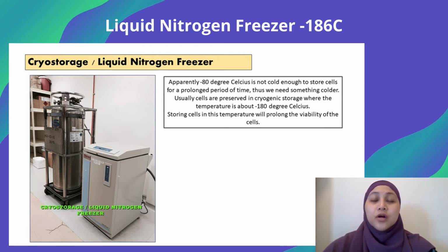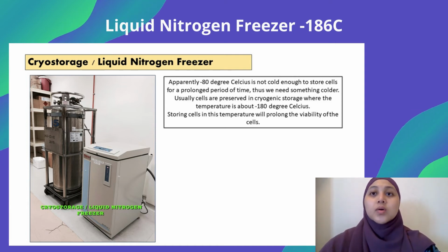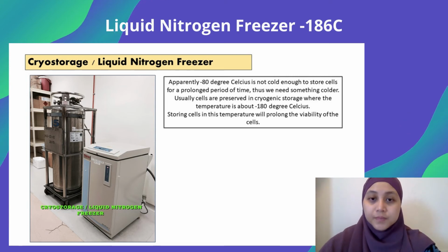Usually, for cryopreservation, liquid nitrogen is used to bring down the temperature. There is a detector to tell us if the temperature goes up. So you must be alert about this. Maybe the liquid nitrogen might need to be filled out or something might go wrong with the equipment. So do not ignore the alarms or the beep sound.